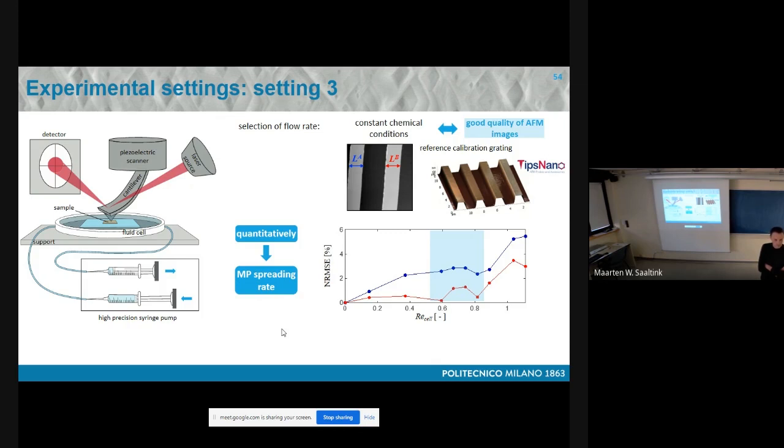So you have a very localized fast dissolution rate at the etch pit, which creates these steps, and then these steps propagate. So you will have a very small zone with a large dissolution rate, which propagates into a larger zone with a smaller dissolution rate, but what counts is you sum everything. So it's not that the pits do that work and they're not important.